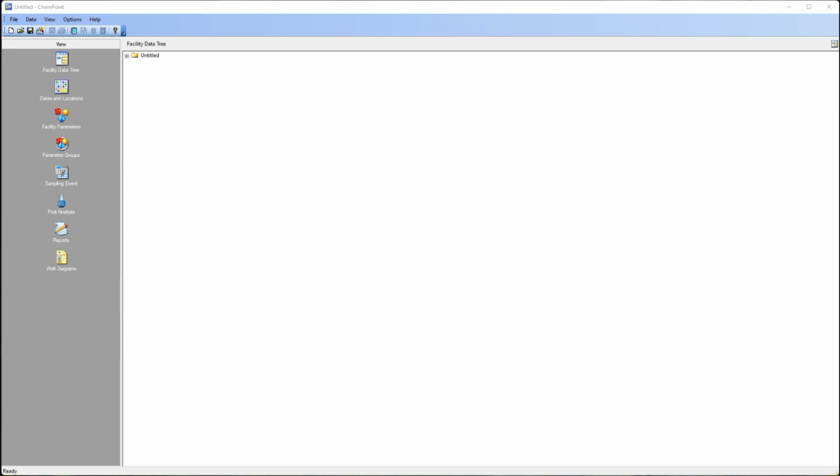This video is a quick introduction to ChemPoint Standard. ChemPoint Standard is an environmental data management desktop application for Windows, and it's pretty easy to use and has a lot of nice features. So let's take a look at some of them.